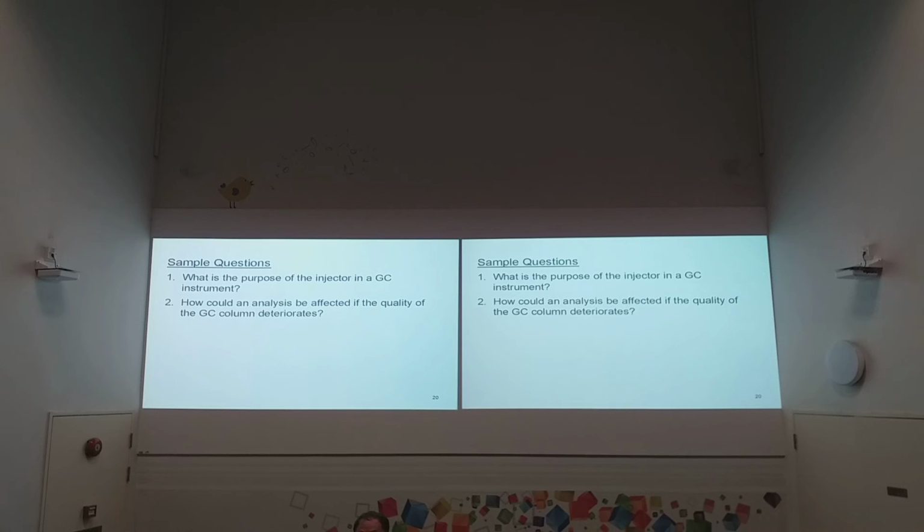I leave it with you first. You think about if the retention time is shifting. In the morning the retention time is 1.1 minutes. Then in the most extreme case, in the afternoon we repeat the experiment, and the retention time shifts from 1.1 minutes to 1.2 minutes for exactly the same product, same solution. Maybe it's the same solution you prepared in the morning, you don't even touch it, right?